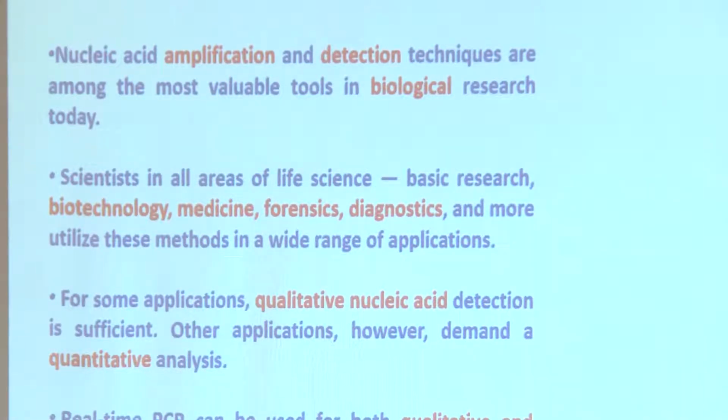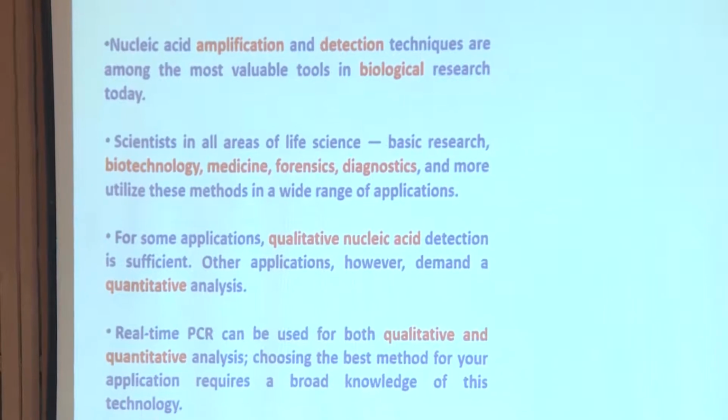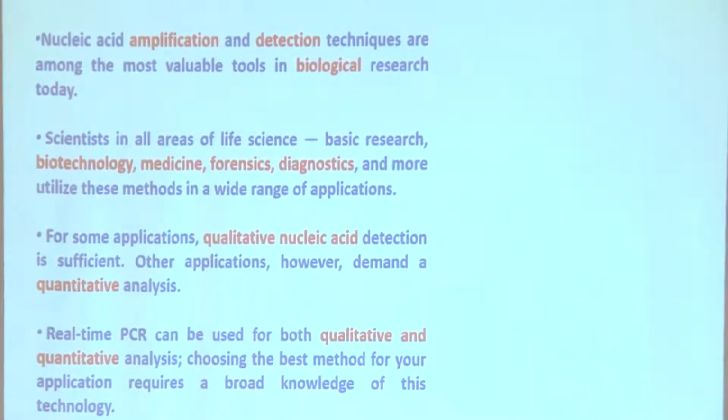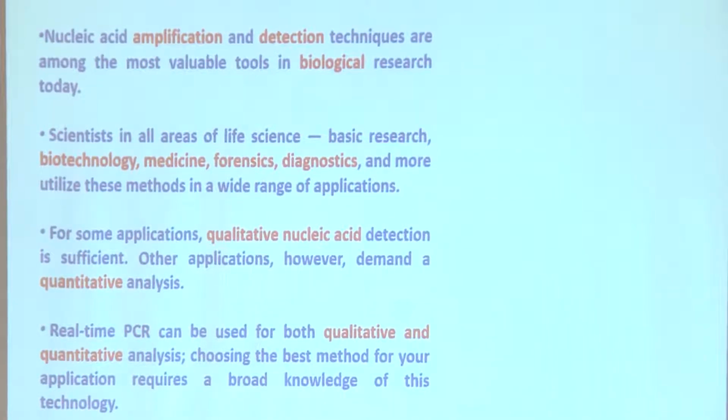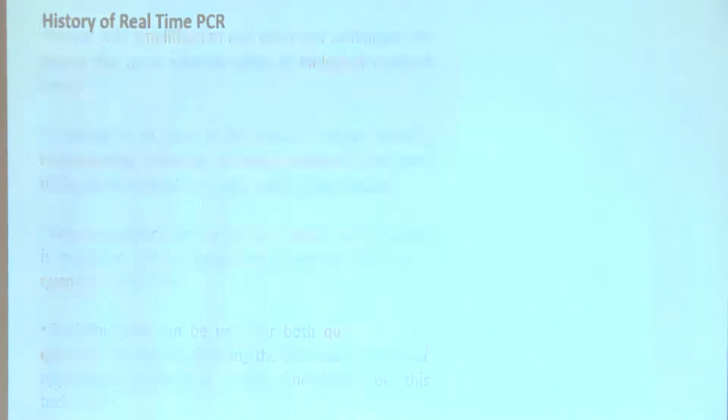And the real time PCR has got the additional benefit. It can tell you not only what is getting amplified, but also how much of that amplicon is getting amplified.